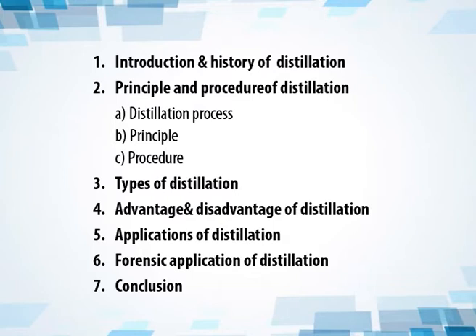Let us start our episode with a look at what we are going to learn today. Modules. So, we will start with Introduction and History of Distillation. Following this, we will move to Principles and Procedures of Distillation, where we will talk about distillation process, principle, procedure, and then we will move to types of distillation techniques, advantages and disadvantages of distillation, application of distillation methods, and finally forensic applications of distillation techniques, and finally conclusions.